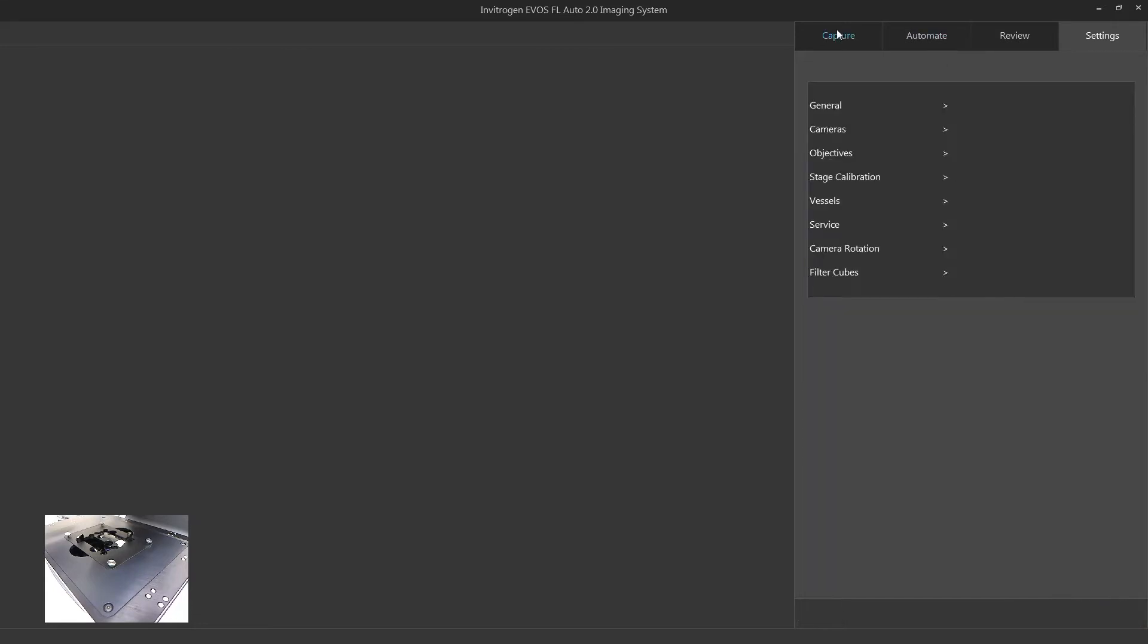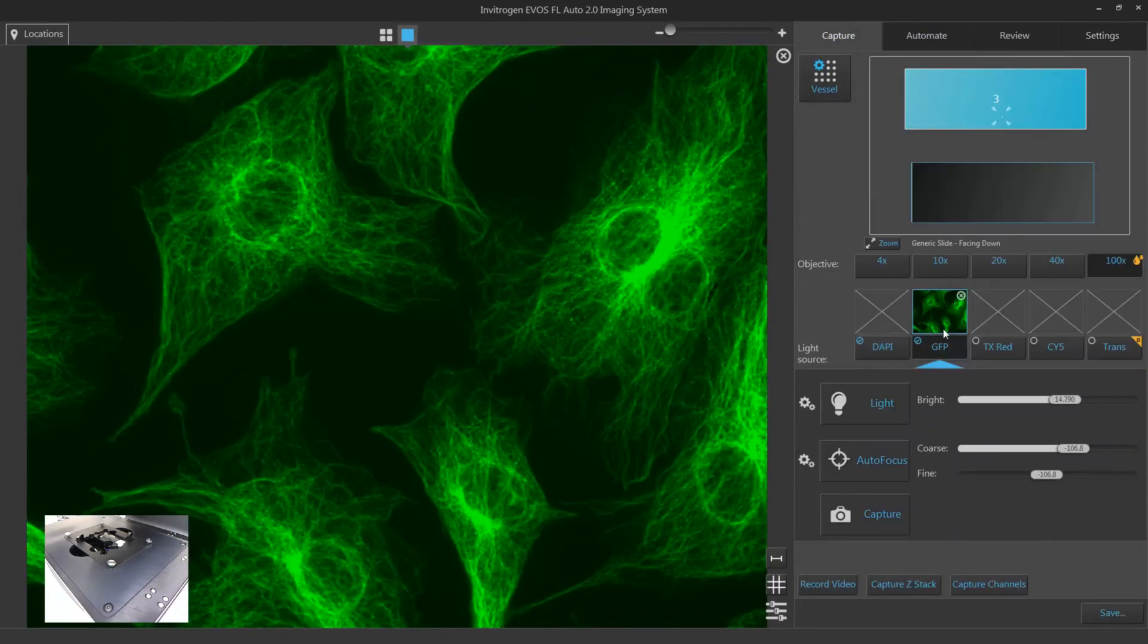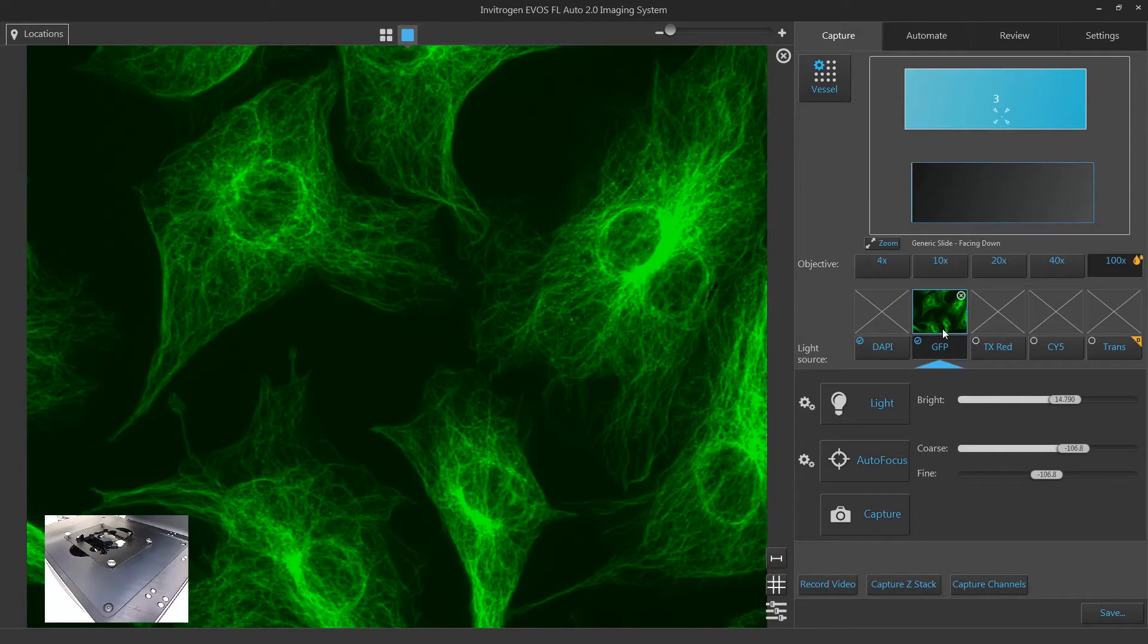In Capture, an oil button will be displayed in the top right corner of the oil objective button.